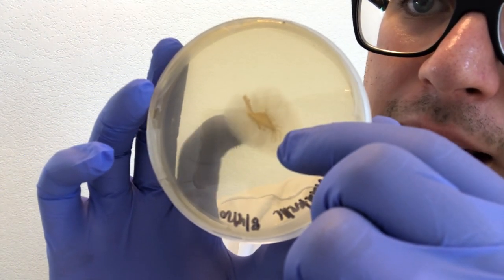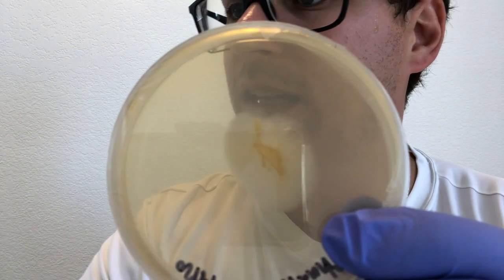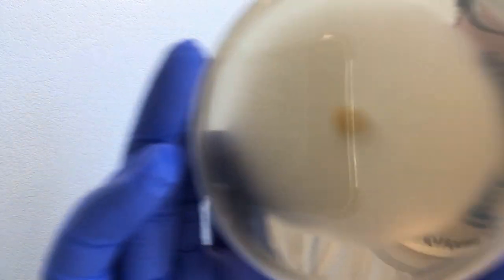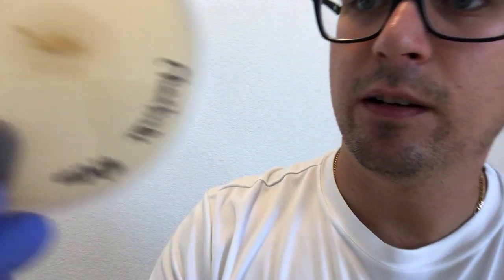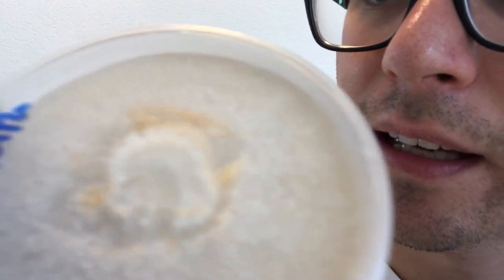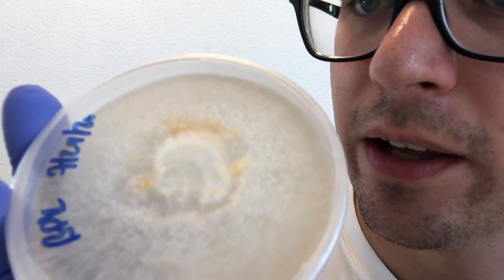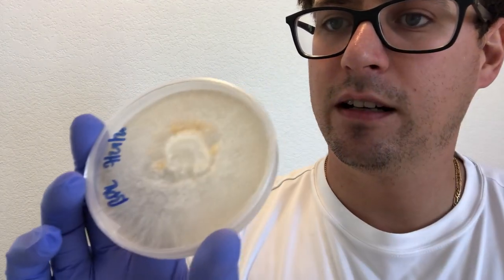Right there where it's got that really heavy dark mycelium—you can see compared to a clean plate, it's nice and uniform. That's a key sign that there's something wrong with the transfer—maybe some yeast from my skin got onto the plate. Then I've got this other oyster mushroom that has some kind of orange growth on there, so that's another indication of possible contamination. I'm just going to go ahead and discard that as well.